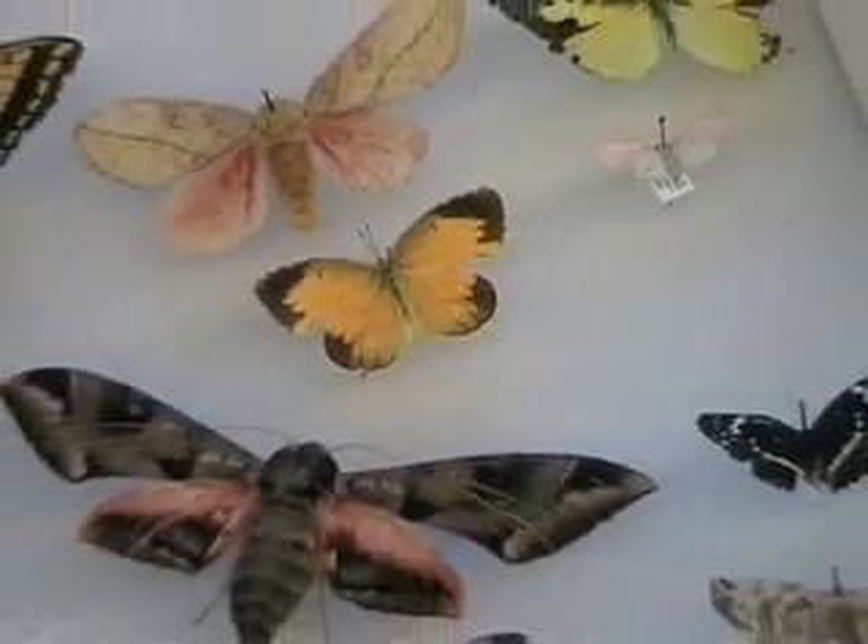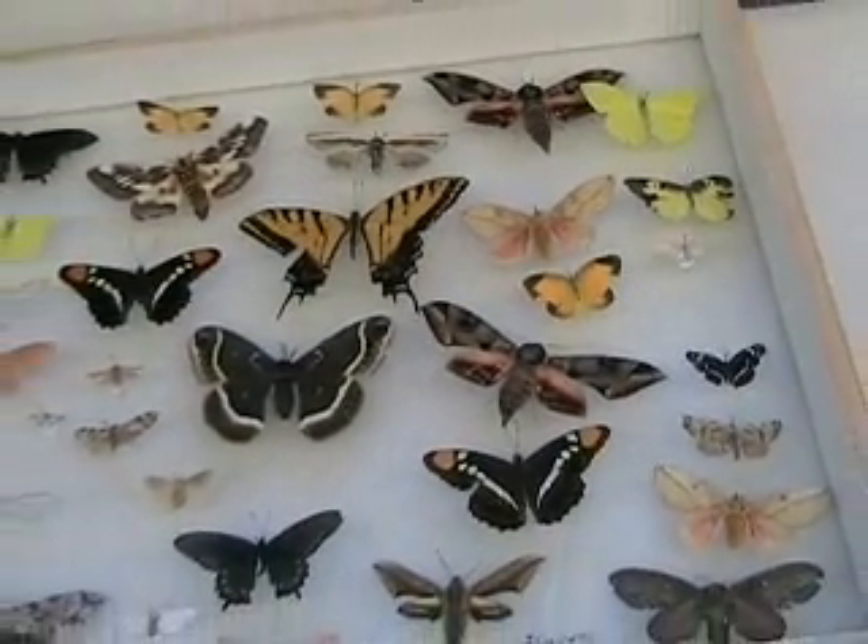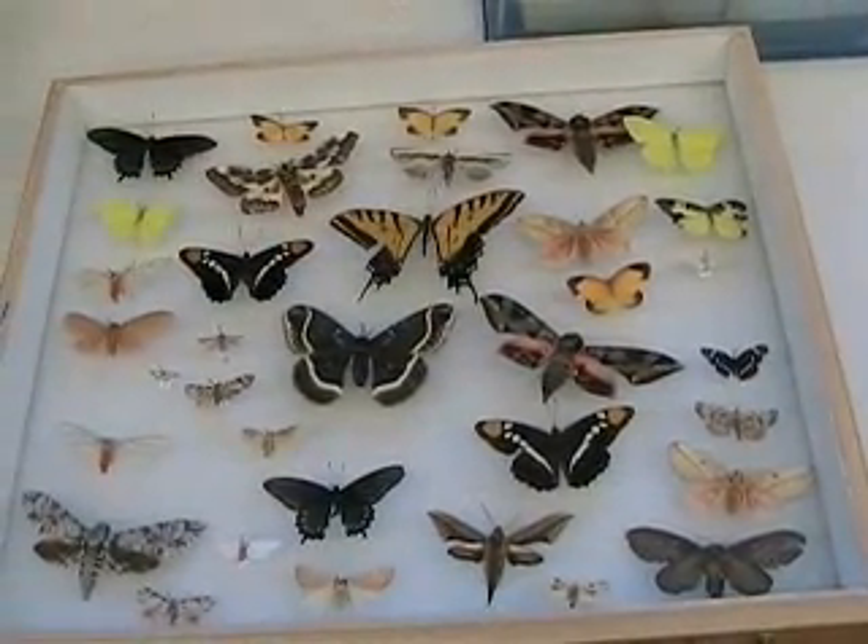Now I want to show you how to spread Lepidoptera. When pinning Lepidoptera, you need to spread the wings, both the right side and the left side, and you want to spread the forewing and the hind wing. This applies to all butterflies and all moths. We're going to start off with moths, since moths will probably be the most common Lepidoptera that you'll collect in your collection.